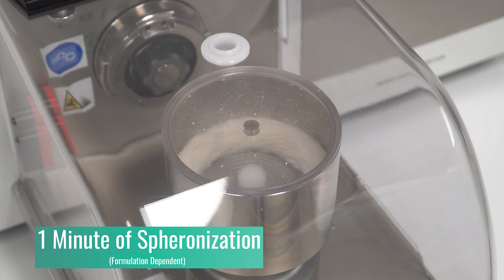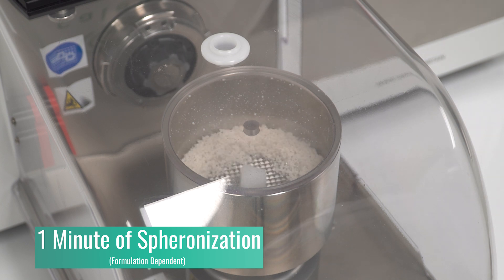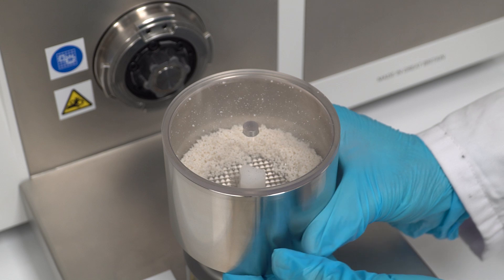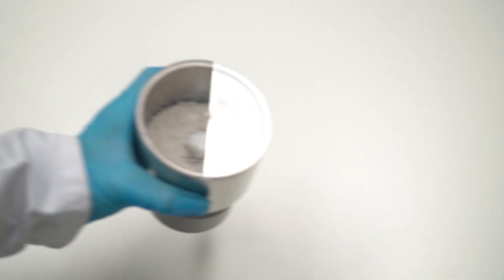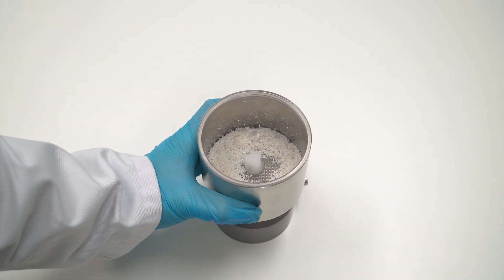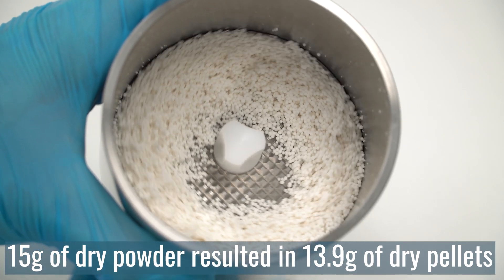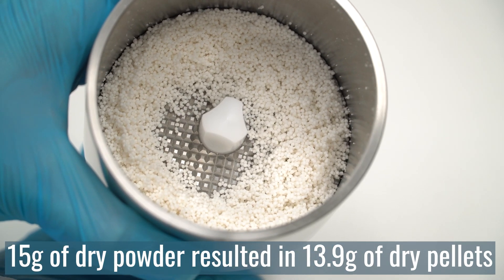Different formulations may require a longer residency time. We can now remove the safety cover and inspect the result. Starting with 15g of dry powder, 13.9g of high quality pellets were made in under 20 minutes.